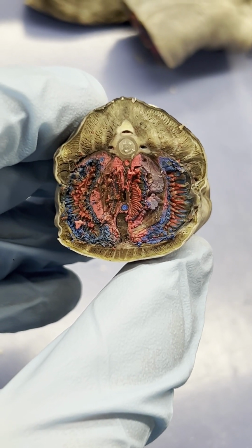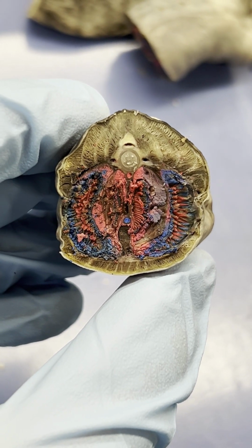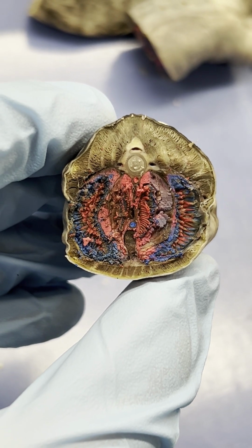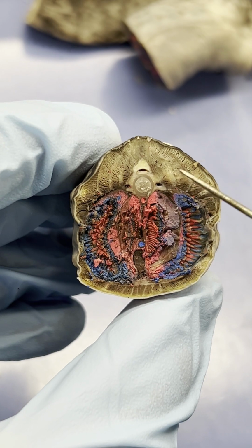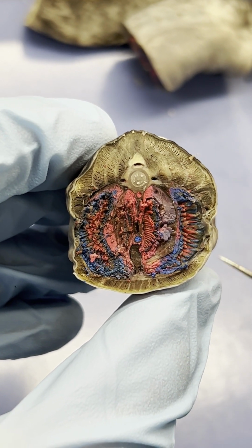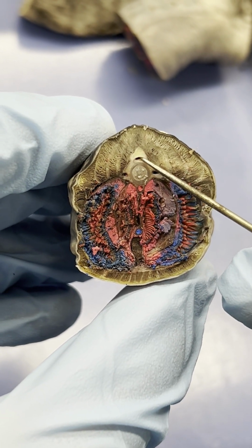Hey guys, let's go over the structures now on figure 3.6B, the cross-section of the branchial slit. Here are myomeres. These again are the muscles of the animal, of the lamprey in this case. We also have our spinal cord, which is right here.